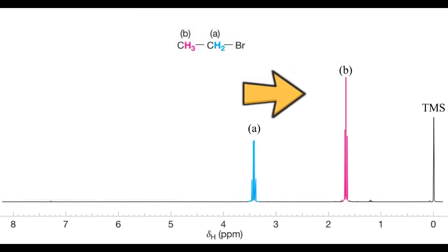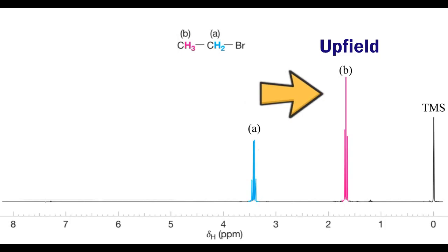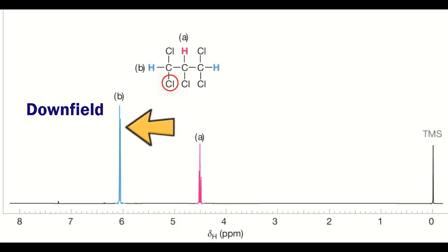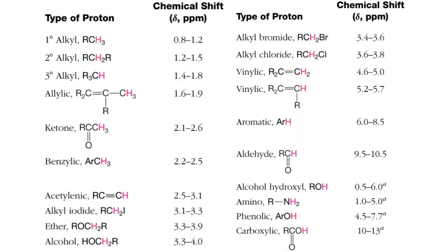If the ppm value of the chemical shift is relatively small, it is called upfield. Also, the upfield peaks are away from the more electronegative atom. However, if the ppm value of the chemical shift is relatively large, it is called downfield. The downfield peaks are always closer to the more electronegative atom. The chemical shift values for each hydrogen atom are provided in parts per million below.